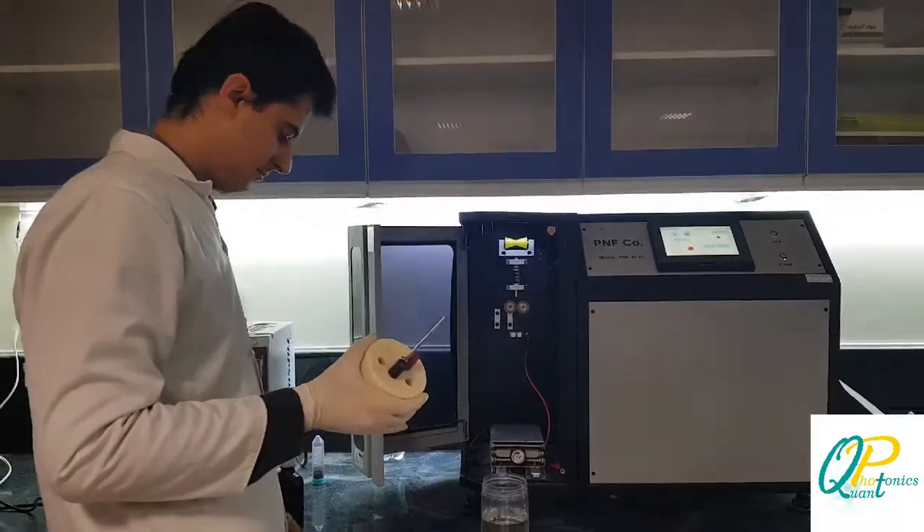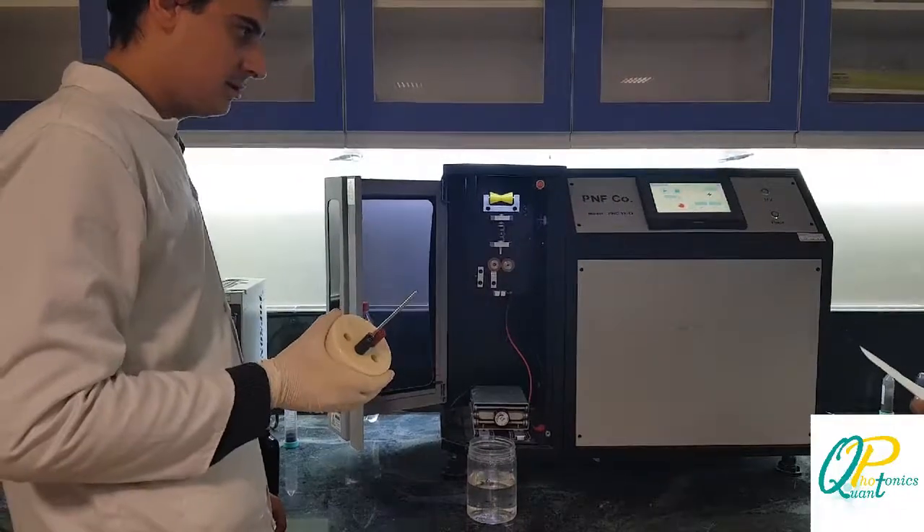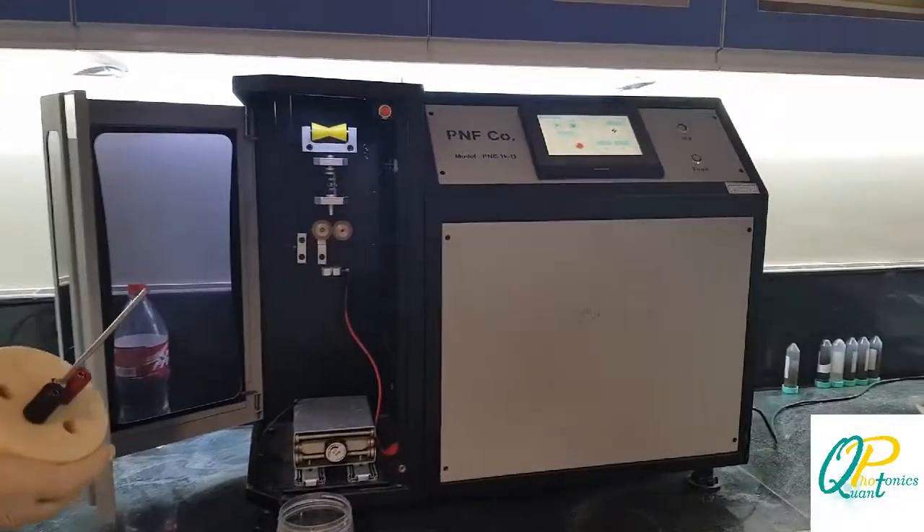Hi guys, I'm from Quant Photonics Research Group, and I'm here to explain something about the wire explosion experiment and device we have here.